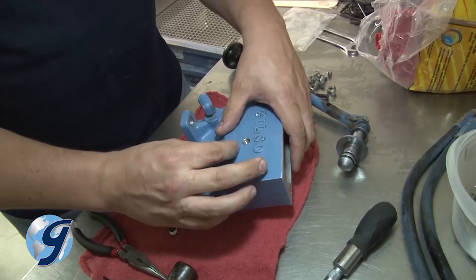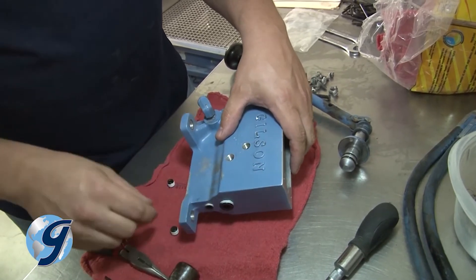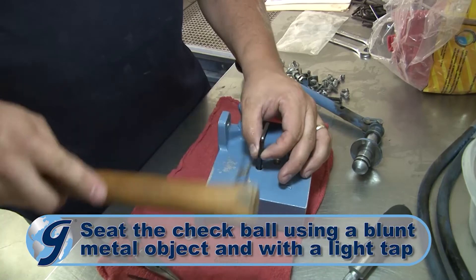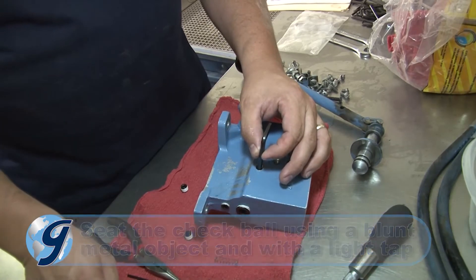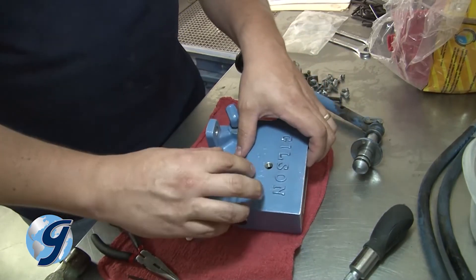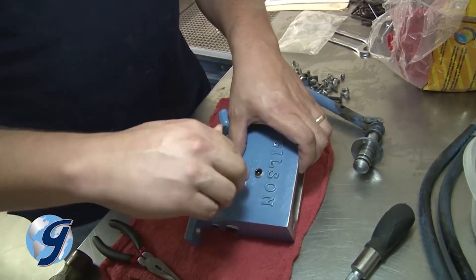Install the intake check ball and, using a blunt metal object with a light tap from the handle of a hammer or mallet, seat the check ball into place. Next, install the intake spring — the longest and thinnest spring in the repair kit — and finish by installing the new plug.